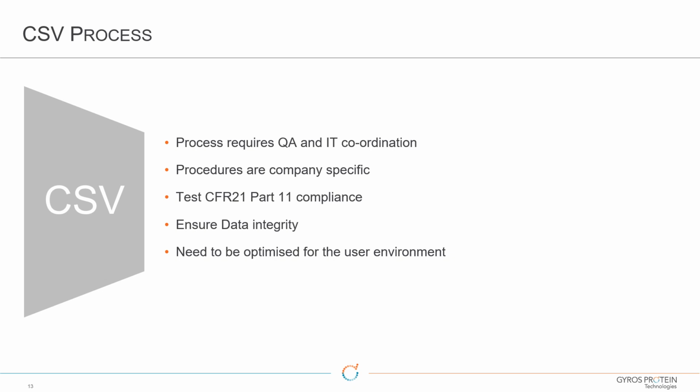Because it's a quality system, but obviously it's software, it requires IT expertise really to actually interpret a lot of the data. And a lot of procedures are company specific. So if you look at a CSV package from one company, it will follow a very different procedure to another company. I've worked for a number of different companies, and the actual processes are slightly different, although the absolute aims are the same.